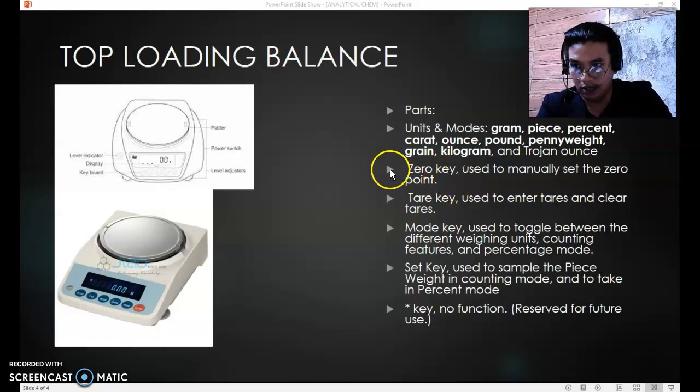Next are the keys located on the keyboard. Zero key is used to manually set the zero point. Tare key is used to enter tares and clear tares. Mode key is used to toggle between the different weighing units, counting features, and percentage mode.